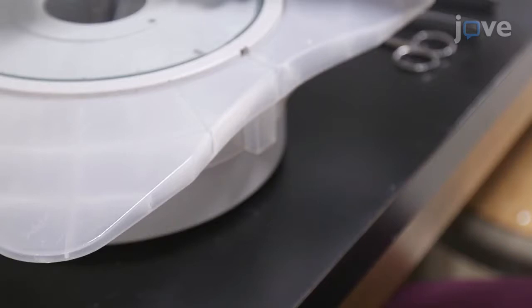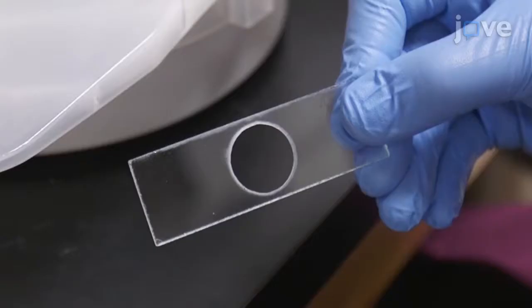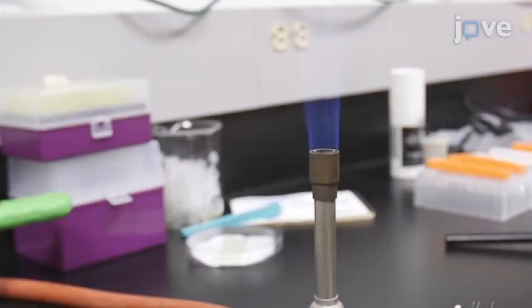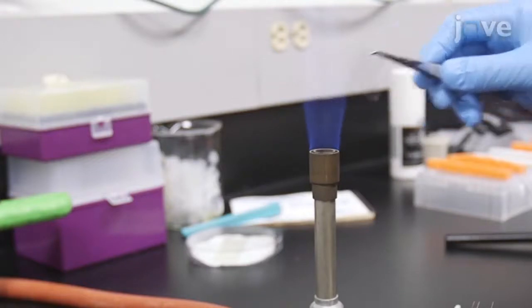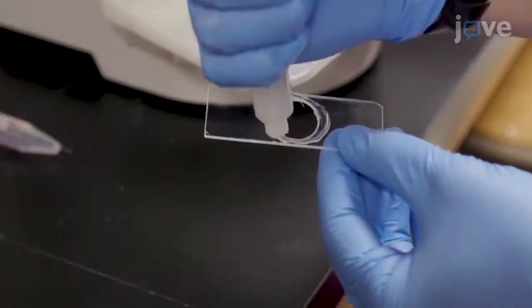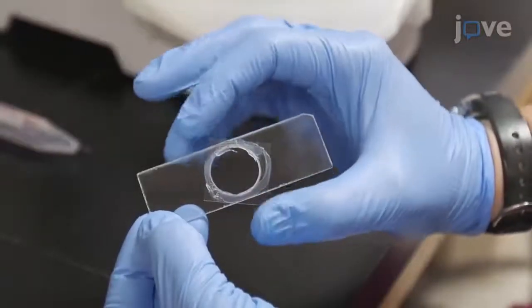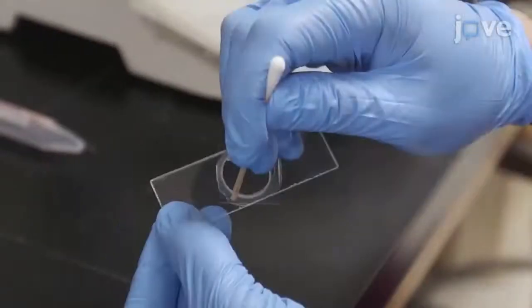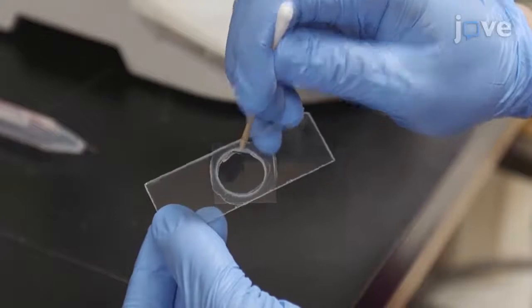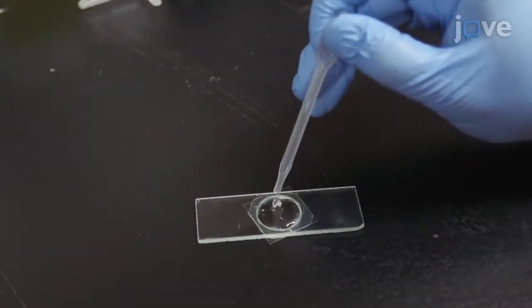To begin, prepare a 75 by 25 millimeter slide with a 20 millimeter diameter circular hole cut out of the center. Then, run a 25 by 25 millimeter No. 1.5 coverslip through a Bunsen burner flame for two seconds. Apply vacuum grease around the edge of the hole in the glass slide. Next, place the coverslip over the hole and press it to form a tight seal. Flip the slide over and fill the newly created dissection well with halocarbon oil.